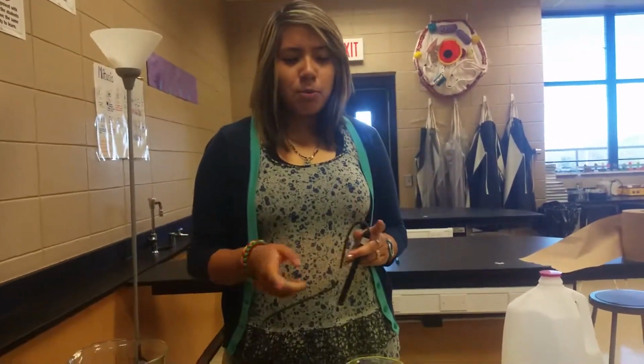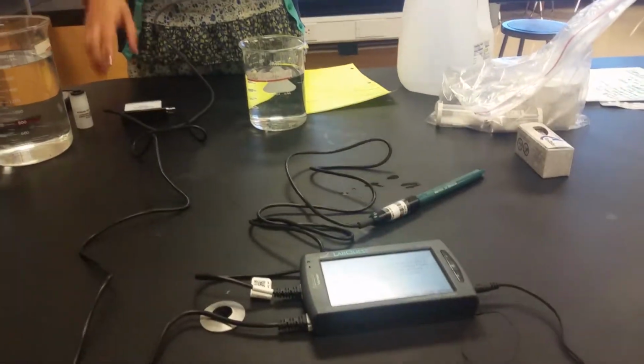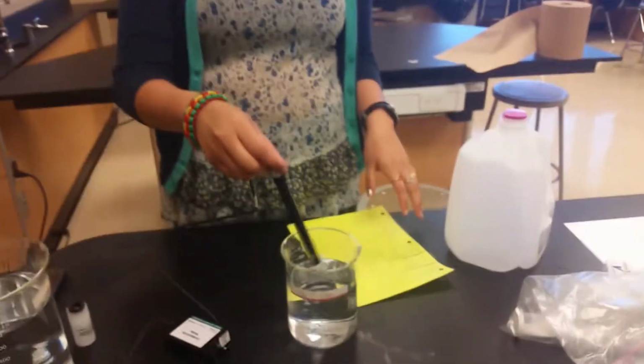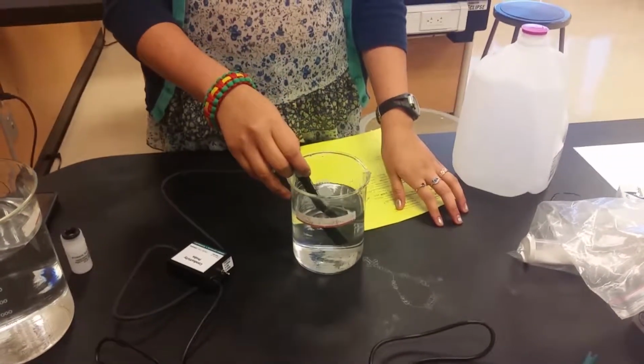To test conductivity on the waters that we collected, we used a LabQuest 2 like we do for pH. And we used a conductivity probe. It has different settings, and we did ours around from 0 to 200 μS range. And most of ours turned out around, the highest one we had was around 250 μS, and the distilled water regular was 6.1 μS. And to test it, all we have to do is turn it on and stick it in the water.